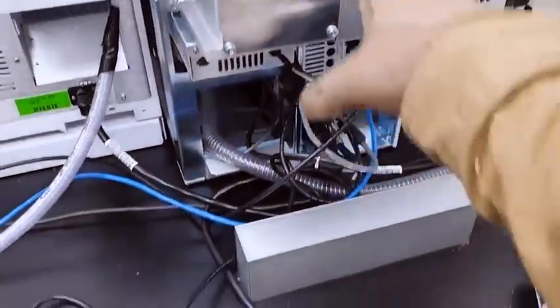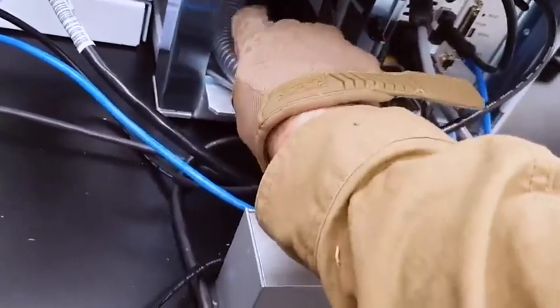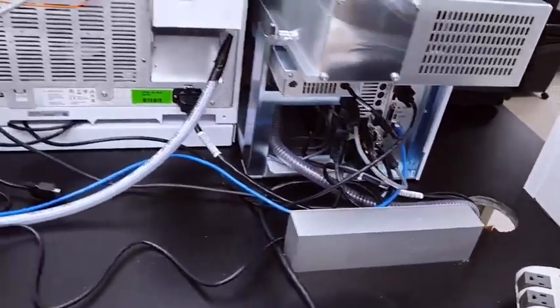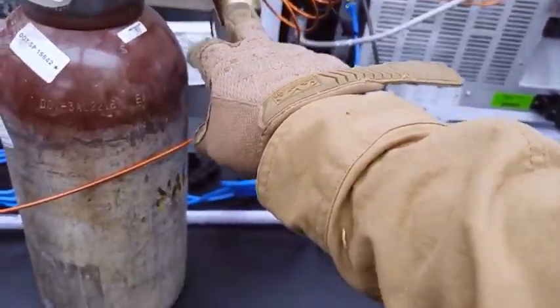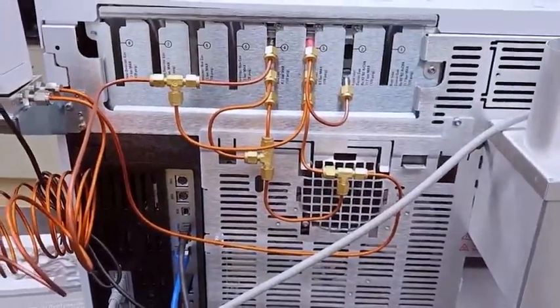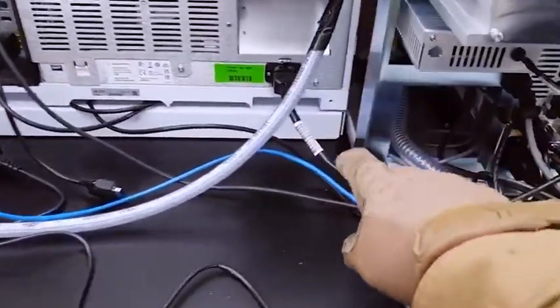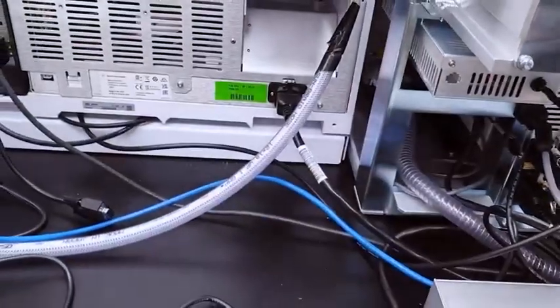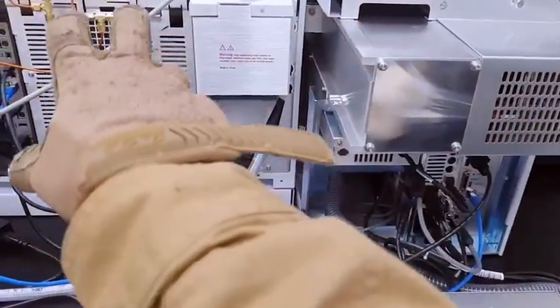Looking at the back of the instrument — this is the back of the mass spec. This hose right here is what pulls the main vacuum on it. There's a rough pump underneath this desk that's pulling the vacuum for the mass spec. Helium is the carrier gas for the gas chromatography. Quite a lot of interesting plumbing on the back of this instrument. It's got networking connections and needs quite a lot of power because there's a lot of heat — it's on a special power circuit. This is a combination: mass spec on this side, gas chromatograph on that side.